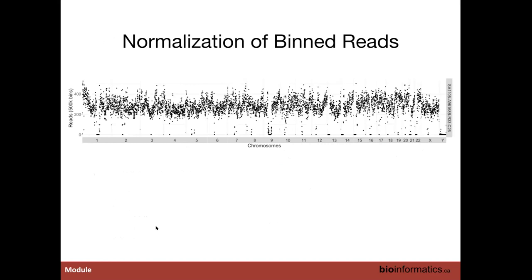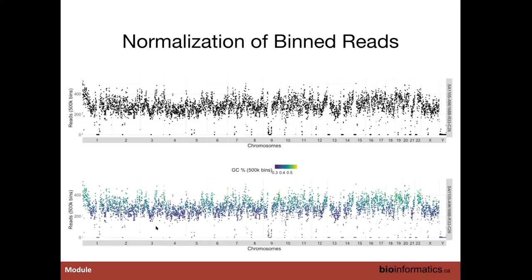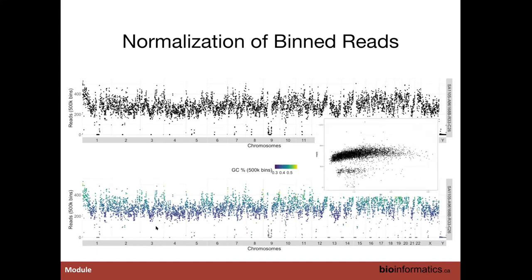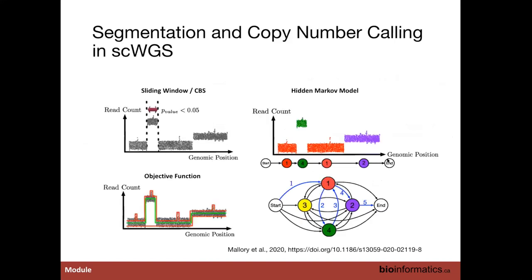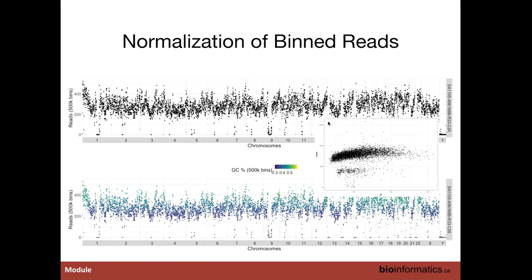To give you an idea of how important GC correction is: if you overlay the GC content of each bin on one of our DLP cells, you can see a strong relationship. Looking at that relationship as a scatter plot — reads on the y-axis and GC on the x-axis — you see this Nike swoosh shape that shows the bias characteristic of sequencing. This bias is usually corrected by a polynomial or LOWESS regression fit to the curve, effectively regressing out the contribution of GC to biases in read depth coverage.